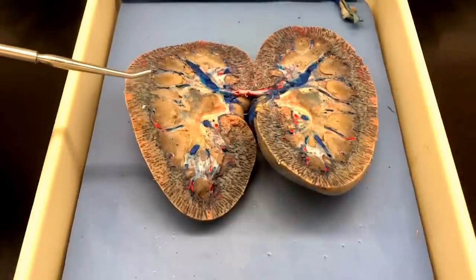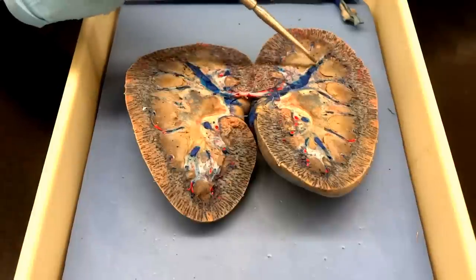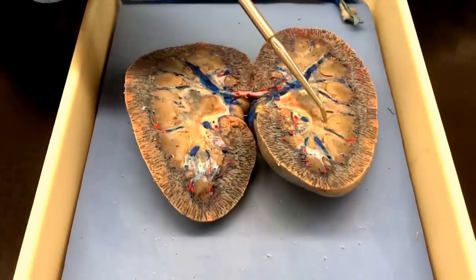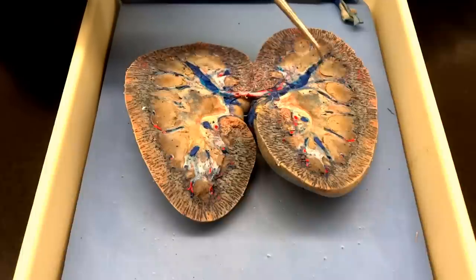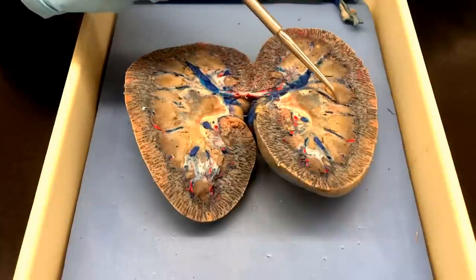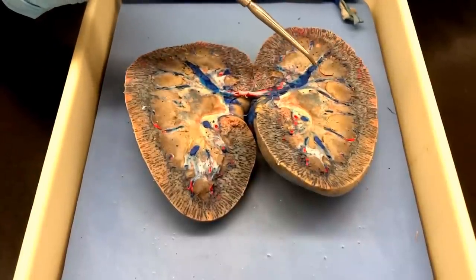Now, in the medulla, you're gonna have the renal columns, which will sit between each one of the pyramids. On here you can see the pyramids — they look like pyramids. Yeah, this is a good pyramid. There's quite a few pretty good ones in there. And then the columns would be in between that.